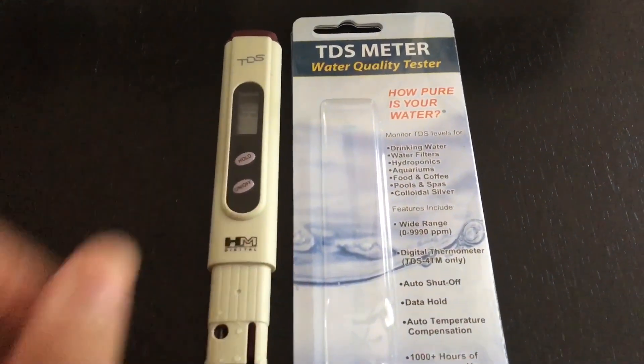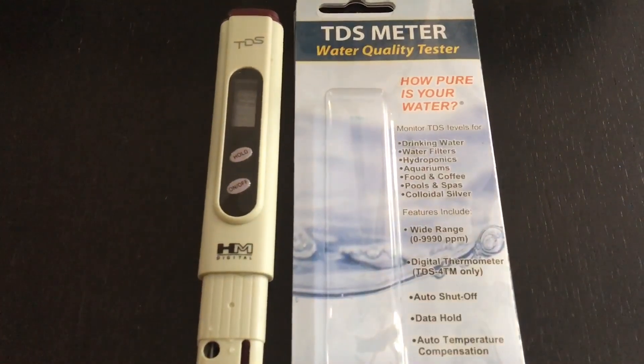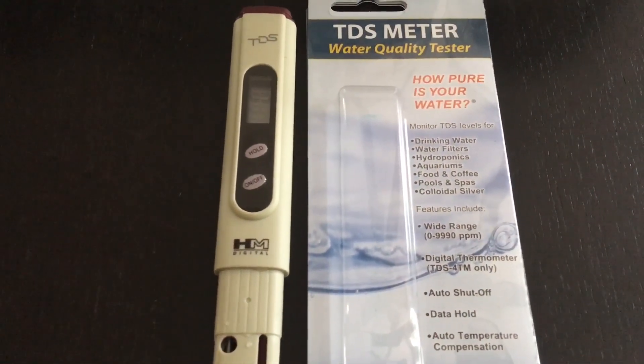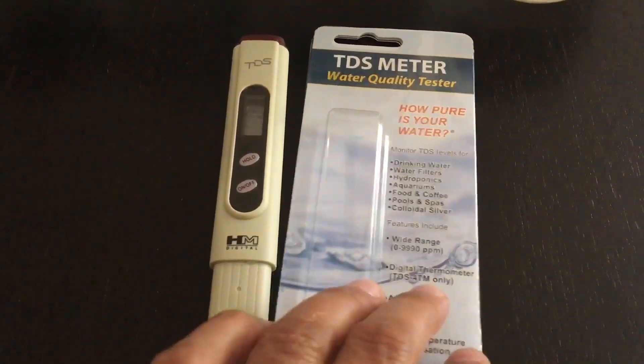I picked this TDS meter up from Amazon. This is what you'll want to use to ensure — specifically if you're testing RO water, which is recommended, and highly recommended RODI water — for your reef tank. This TDS meter can be picked up on Amazon Prime for less than $20.